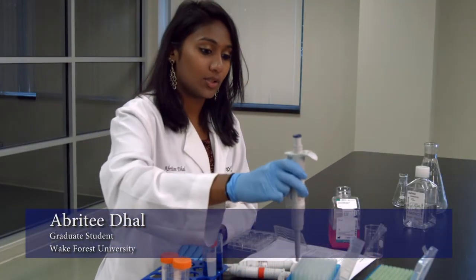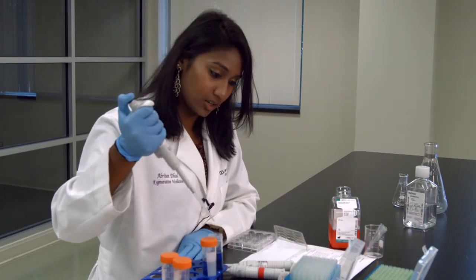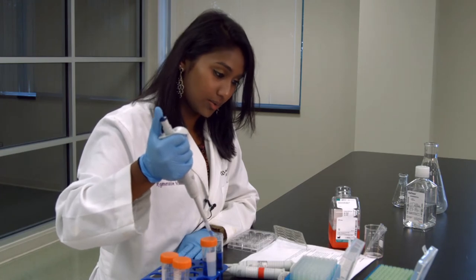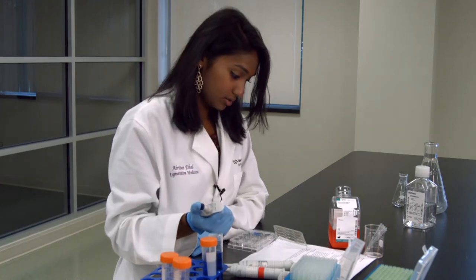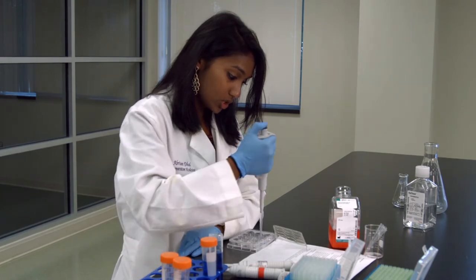The next thing we'll talk about is ejecting the tips. So we get the tip on, and I like to do the double just to make sure it's actually on. So we have our liquid, and take the liquid out. And so now we've already used this tip, and we don't want to use it again.